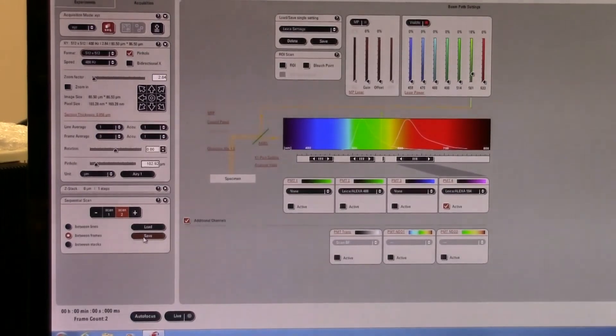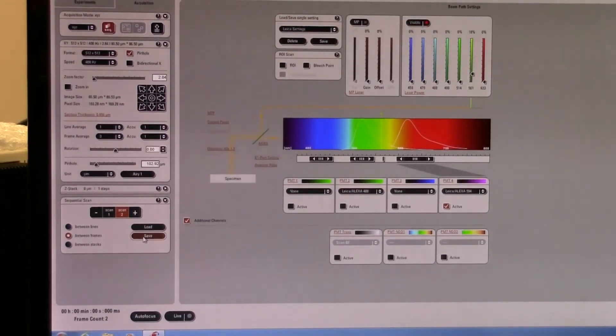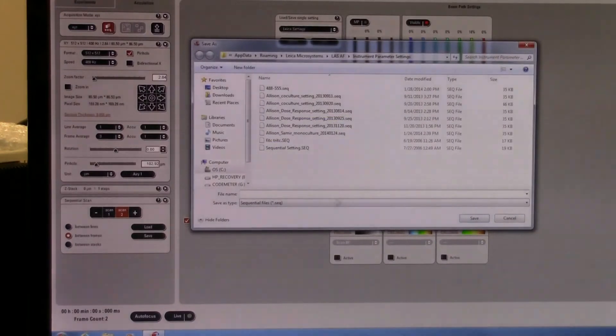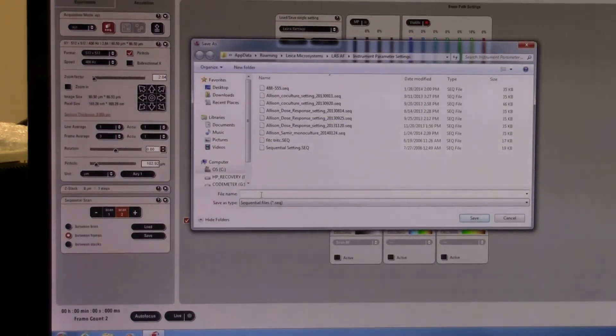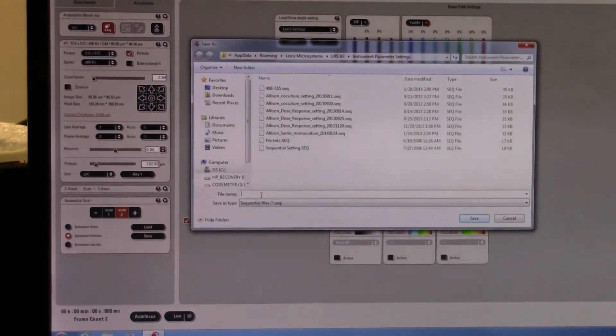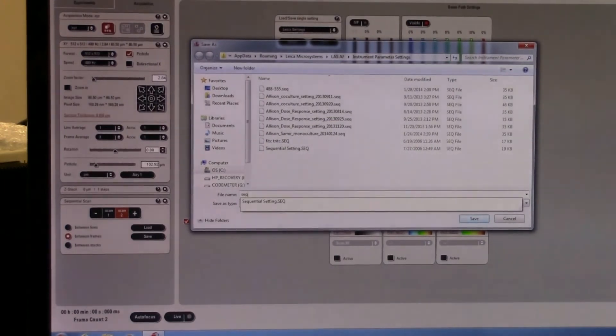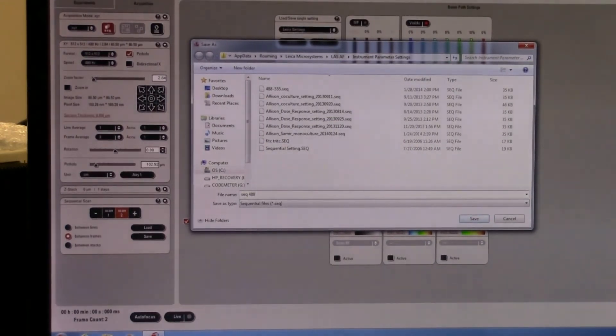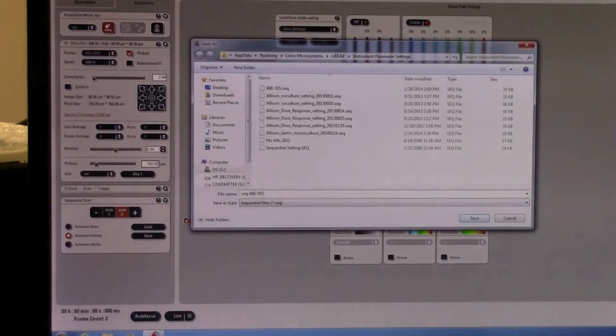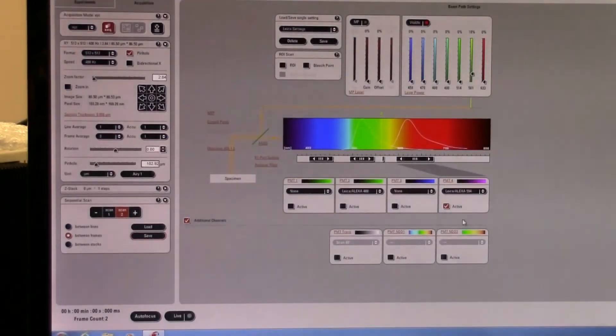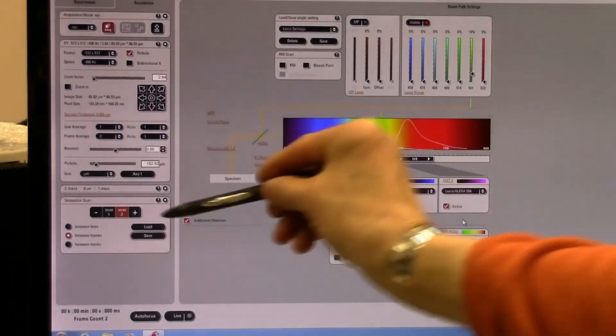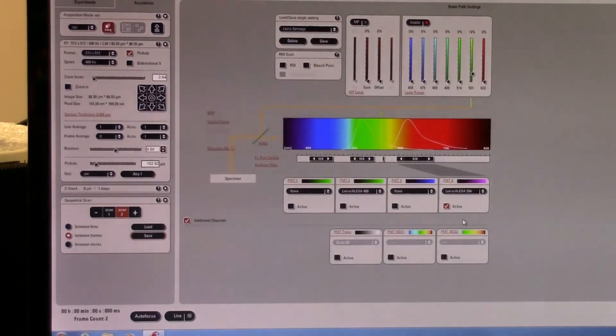I'm going to press save. This is going to give us a sequential scan setting and I'll name that. Once you've saved the setting once, you can just load it in the future if you're redoing the same experiment again.